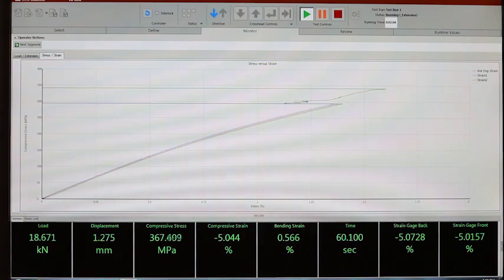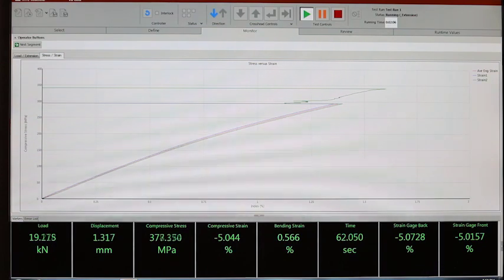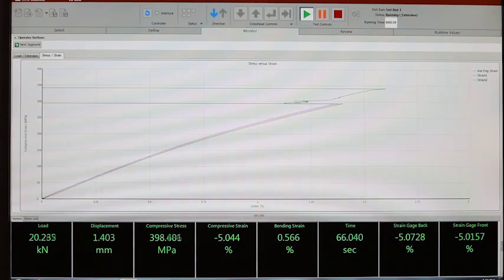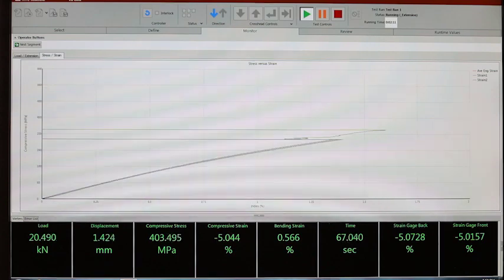We can see that our strain gauges failed, but we can complete the test until specimen failure.